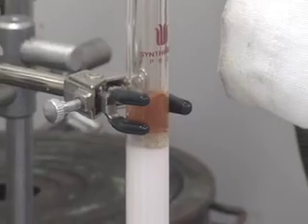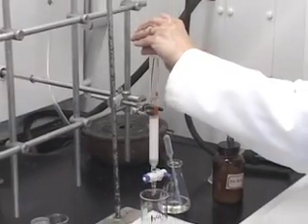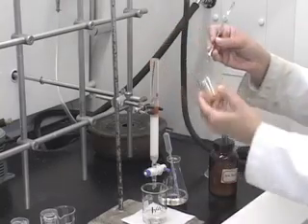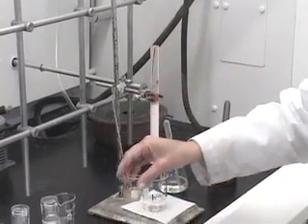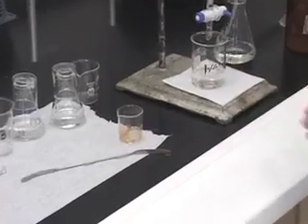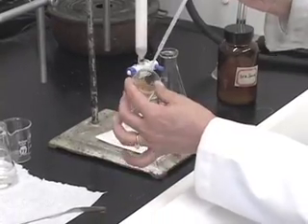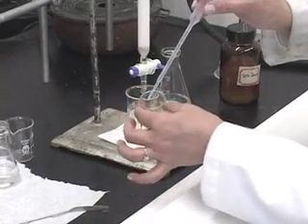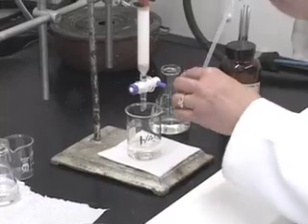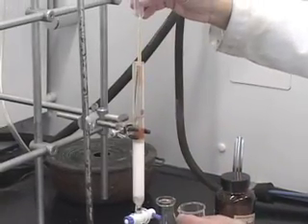After carefully transferring all of the solid mixture onto the column, you notice that there is still a little bit sticking onto the beaker surface. What you want to do is rinse it, but with very few drops of hexane — not any other solvent. Rinse it with hexane and transfer that onto the column.